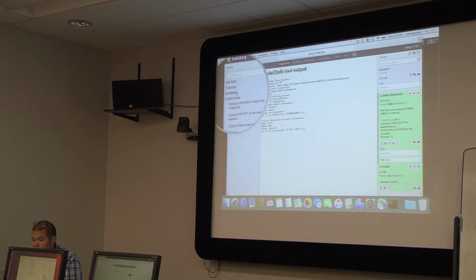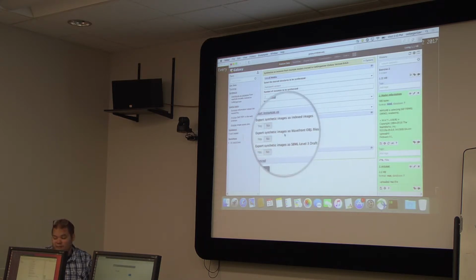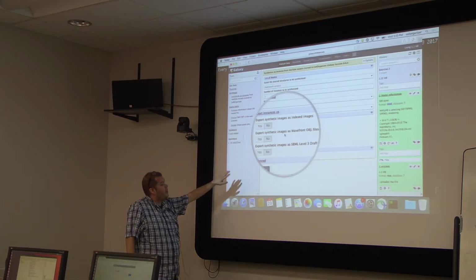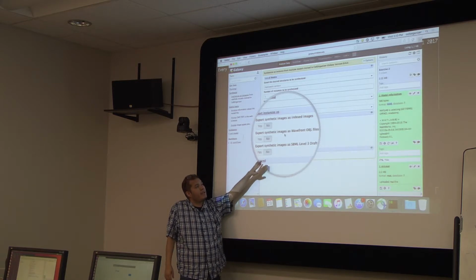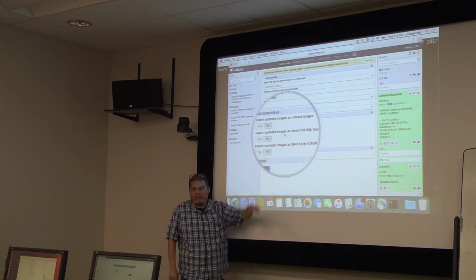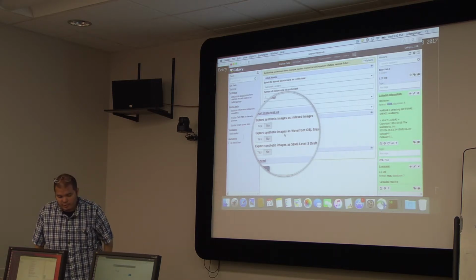So I'm going to go to synthesis. I'm going to synthesize an option. Now, like I told you before, we only kept the 3 most important things open to you guys because they're the ones that you care about. If you click synthesize, it will create an OME-TIFF. If you click SBML, it creates SBML. The OBJs are to import into Blender and other tools. And the index images are only important for the 2D case, even though you could create a 3D index image to use with tools like Virtual Cell.